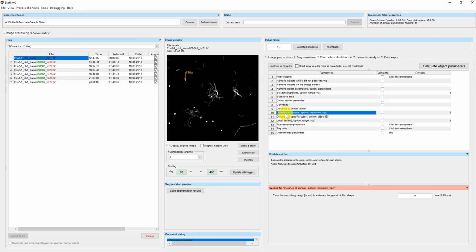For every cube, you can calculate the distance to the surface, which is interesting if you want to calculate, for example, reporter signals based on the distance to the surface. Let's say to calculate nutrient diffusion inside the biofilm. The distance to surface property for each cube is interesting if you fuse the reporter to a nutrient-based function of cells. By relating the reporter brightness to the distance to the surface, you can extract useful information on the nutrient diffusion inside the biofilm.